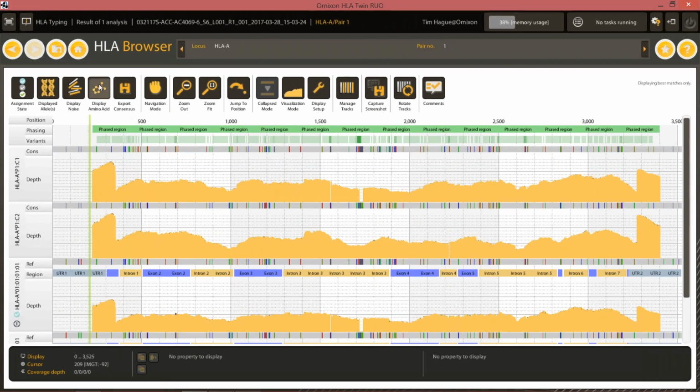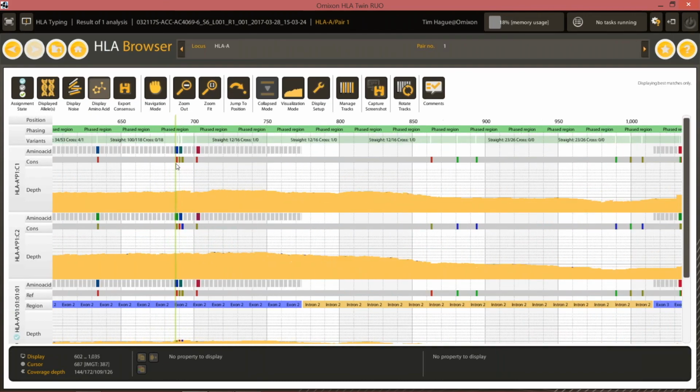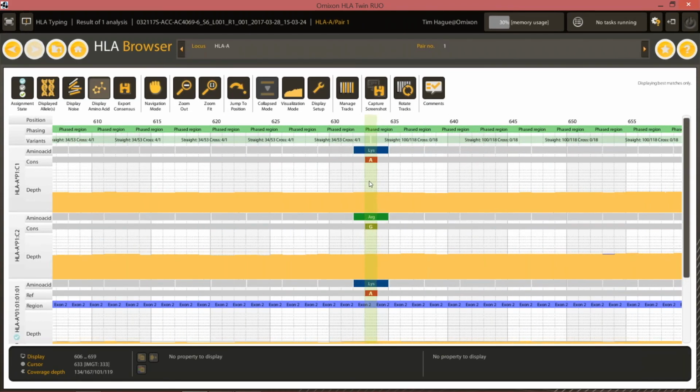And another of the new features is to display the amino acids. Again here I'm using a display which is only highlighting the differences between the 2 sequences that we're looking at. We've got the consensus sequence up here for the first allele at HLA-A, and the consensus sequence here for the second allele at HLA-A, and all of the identical positions and identical amino acids have been grayed out, and we're just highlighting the ones that are different, both the positions and the amino acids that are different between these 2 sequences. This is a very useful feature if you find a novelty, because you can immediately tell whether or not this is affecting the amino acid coding sequence of the protein.